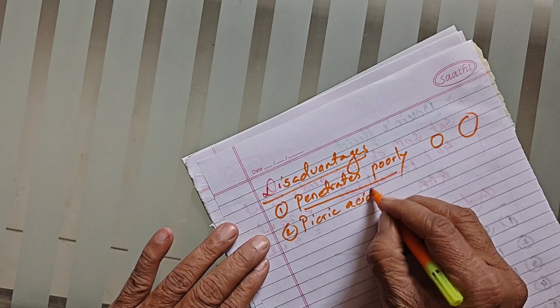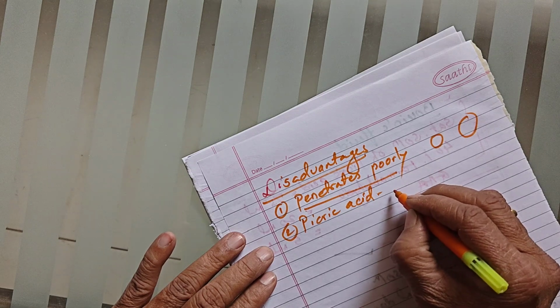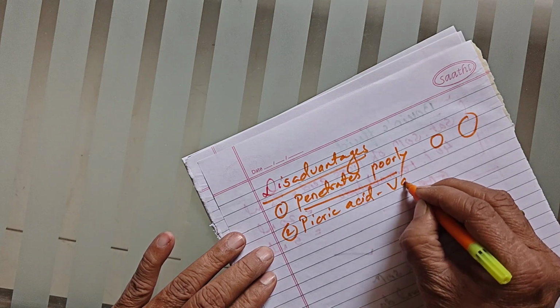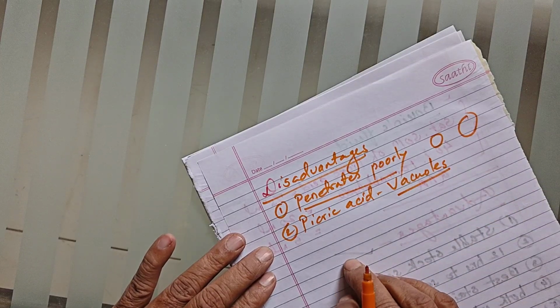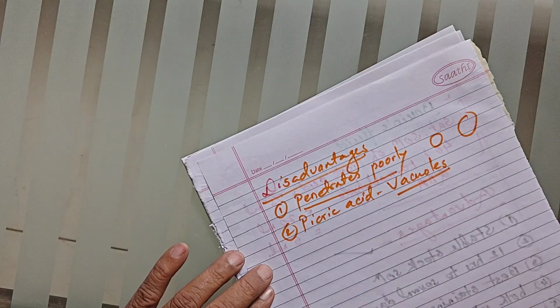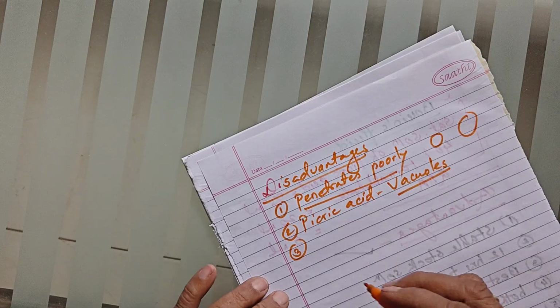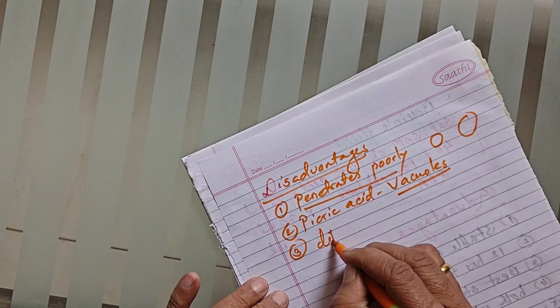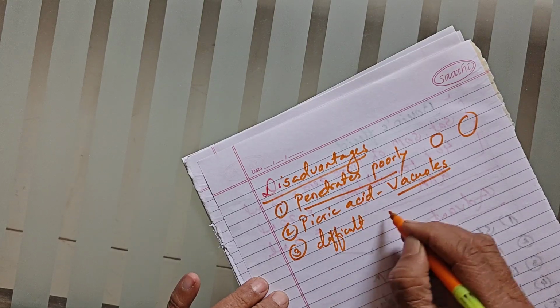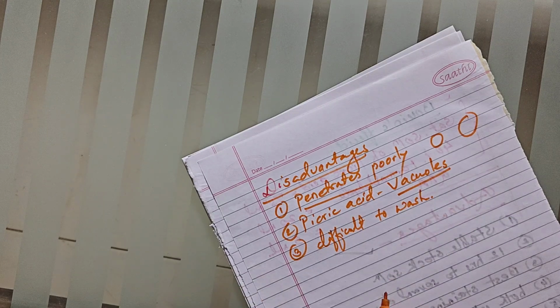This picric acid forms water soluble compounds with many organelles of the cell, so large vacuoles are seen in the tissue. This is because of picric acid. And the third disadvantage is that Bouin's fluid is very difficult to wash. So these are the disadvantages.